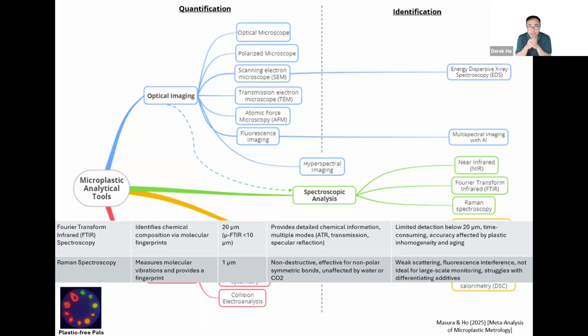For spectroscopic analysis, there are two main methods, FTIR and Raman spectroscopy, with their micro counterparts. These two methods are vibrational spectroscopic methods, and they are actually complementary in nature. FTIR absorbs in the infrared region, whereas Raman scatters light and it's within the UV-vis region.